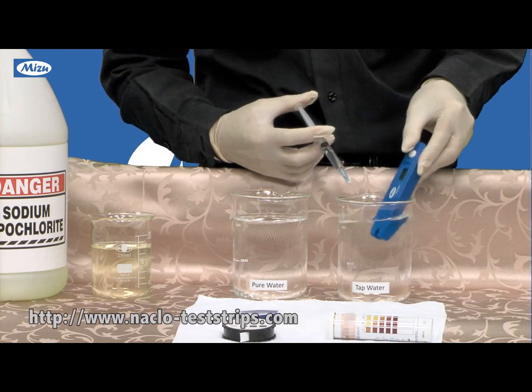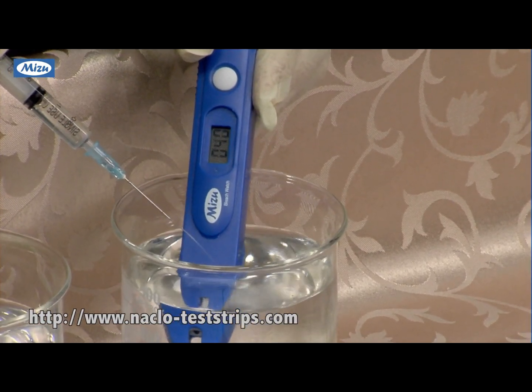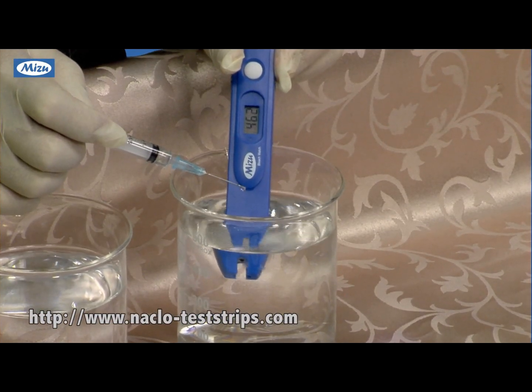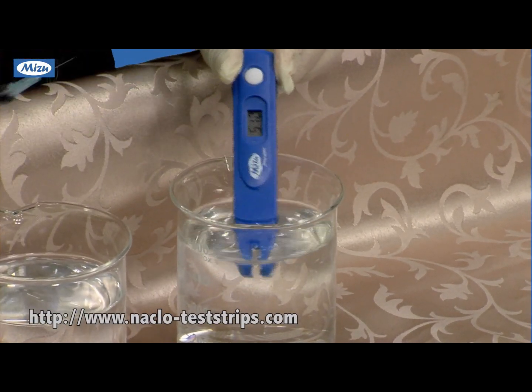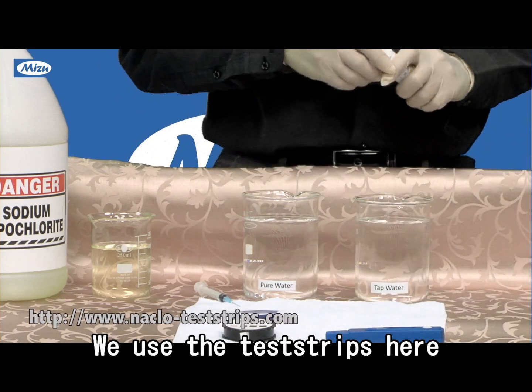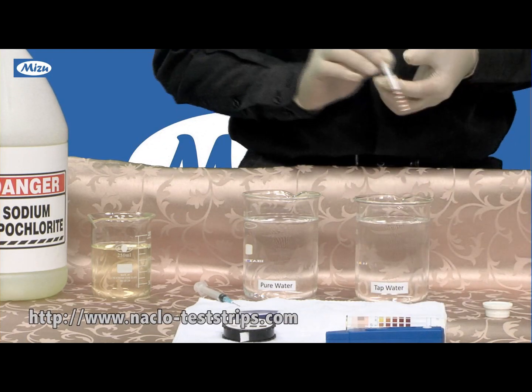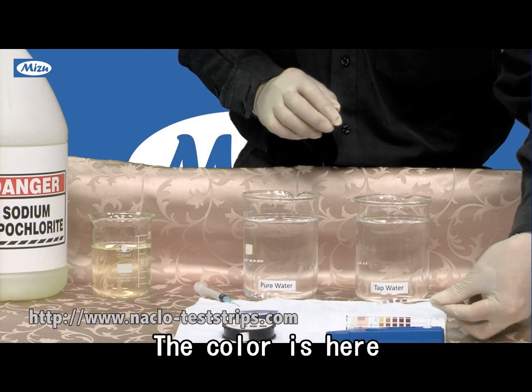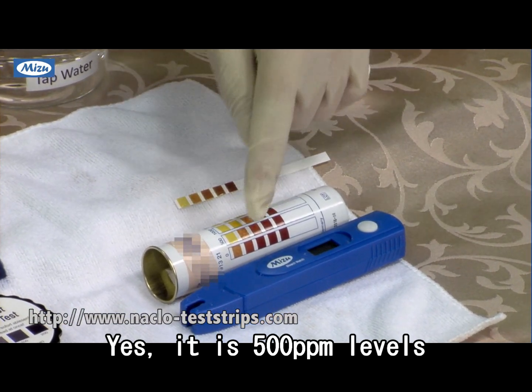So the same. We use the test strips here. You see the colors here — it's in the 500 level.